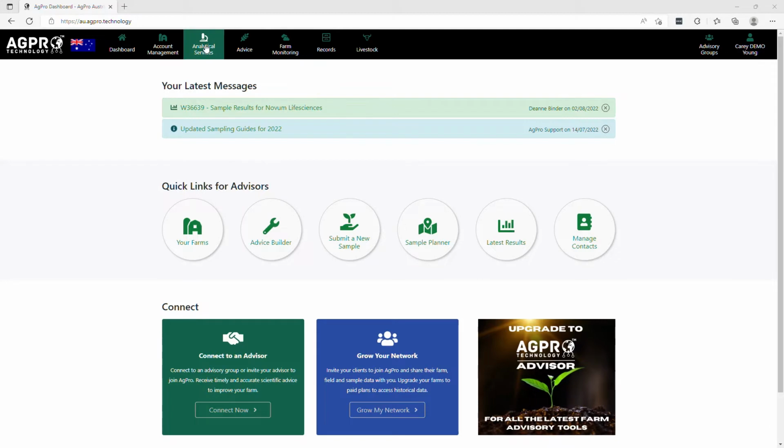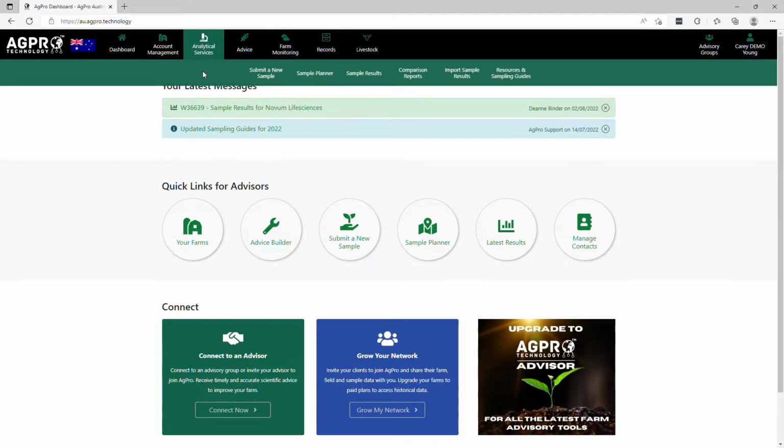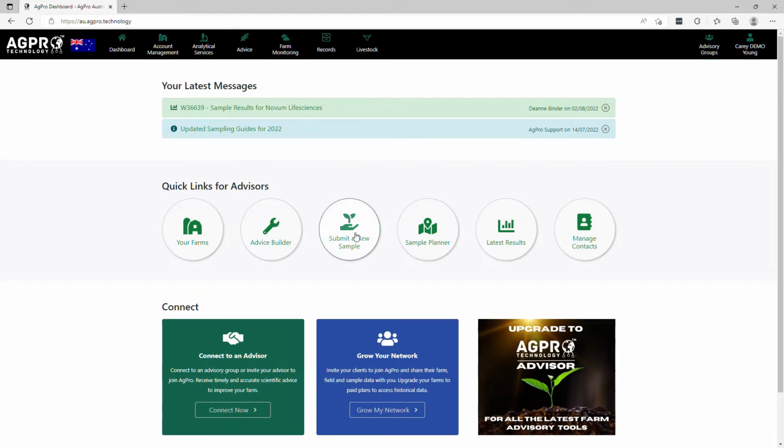Samples and results are grouped under the Analytical Services tab, and there are also helper links to some of these pages from the dashboard quick links. Let's submit a new sample.